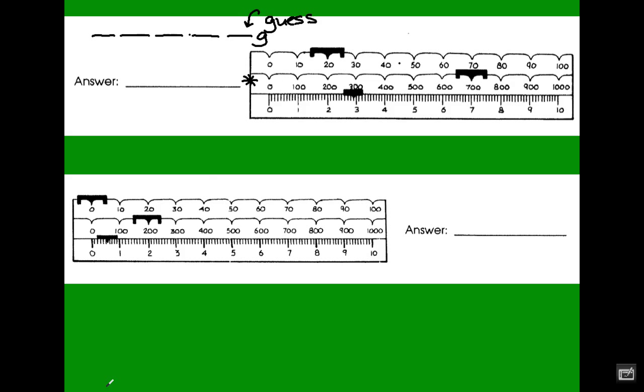So if we look here, each of the top 2 beams on the triple beam balance have these little notches. And so this little notch here is actually pointing at 700. So the first number we fill in is a 7. In other words, we are taking 700 plus, then we go up to the top bar, and that one is at 20.